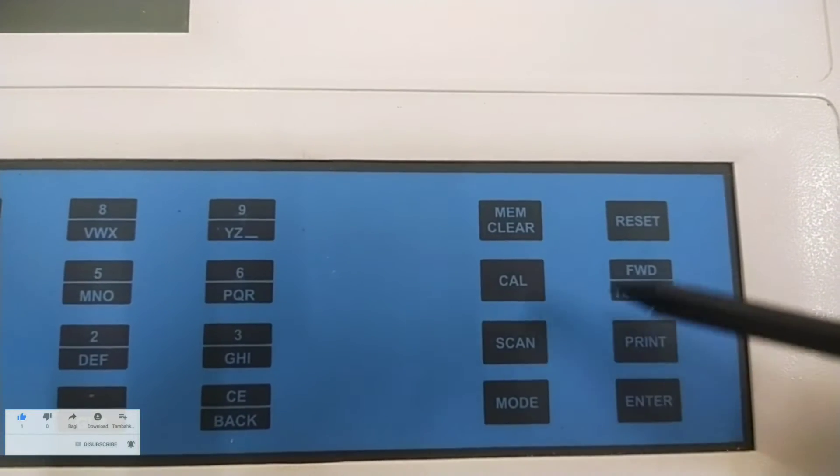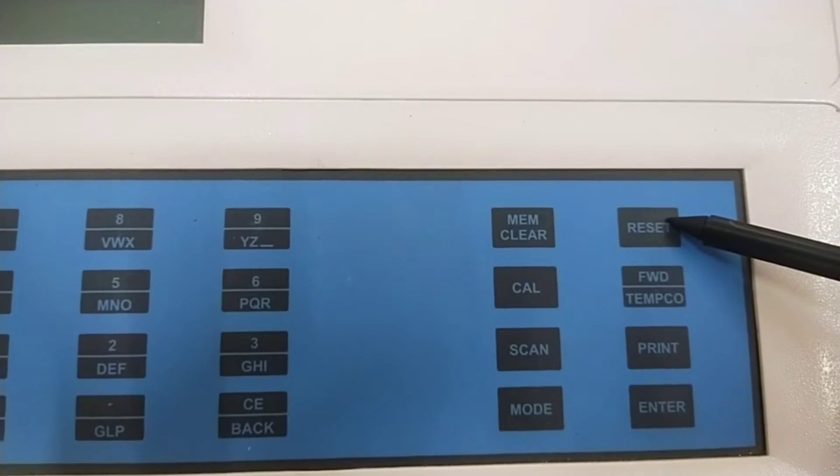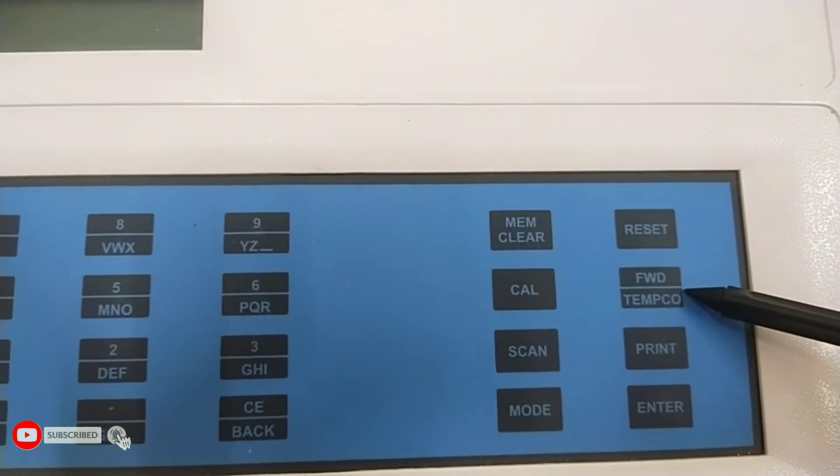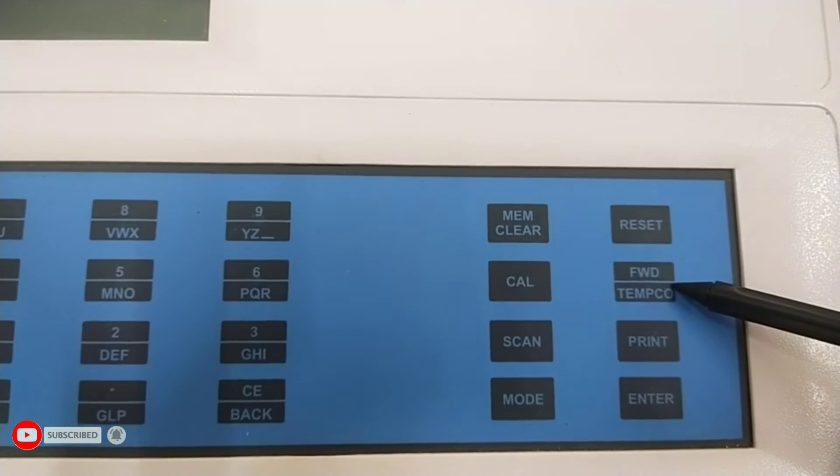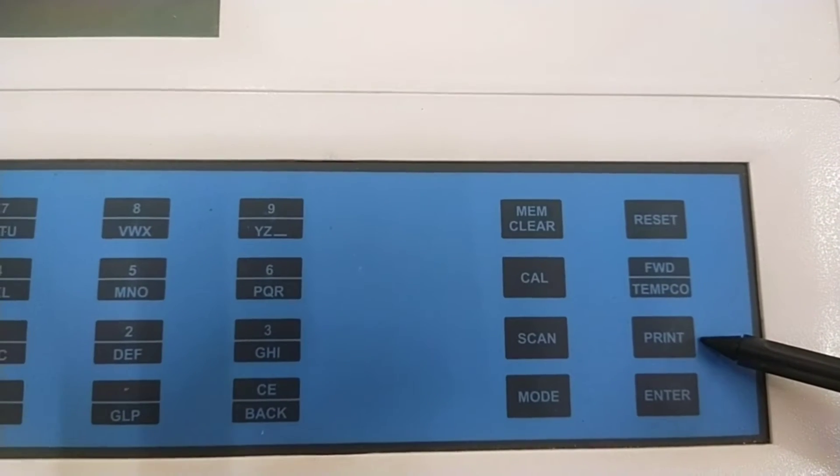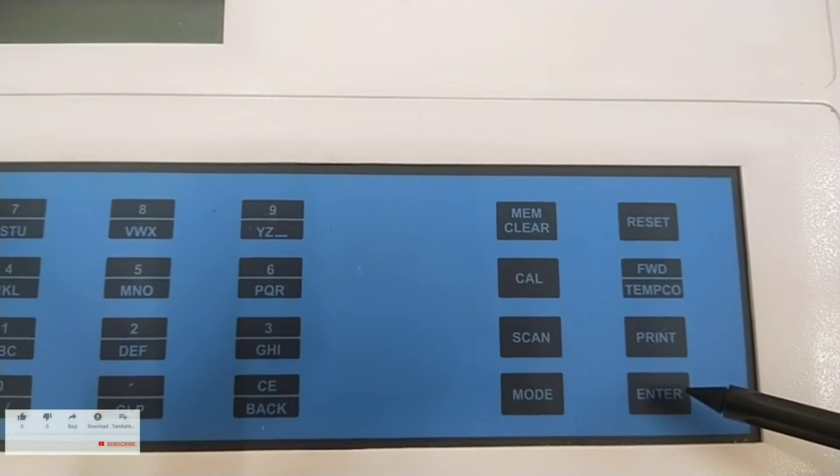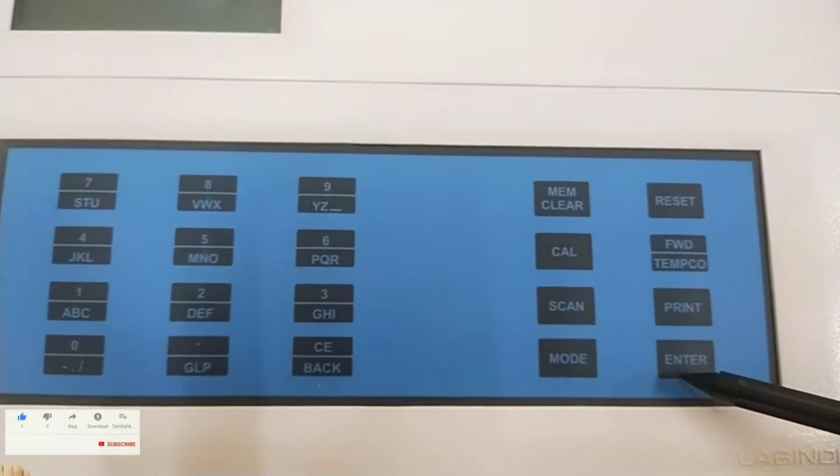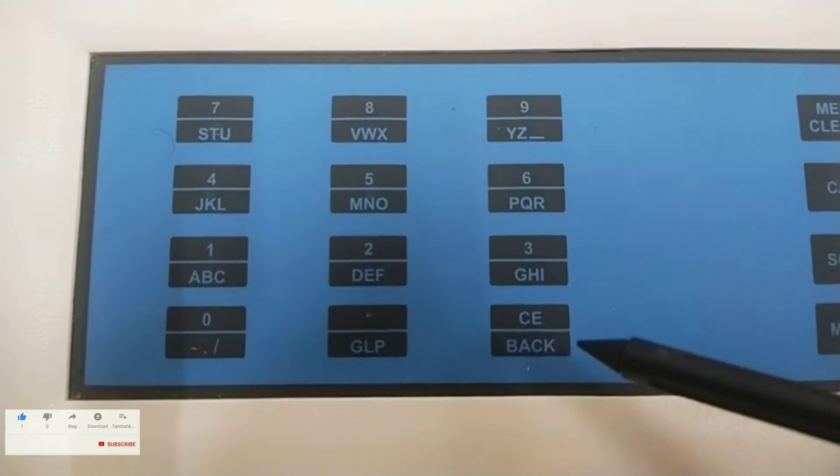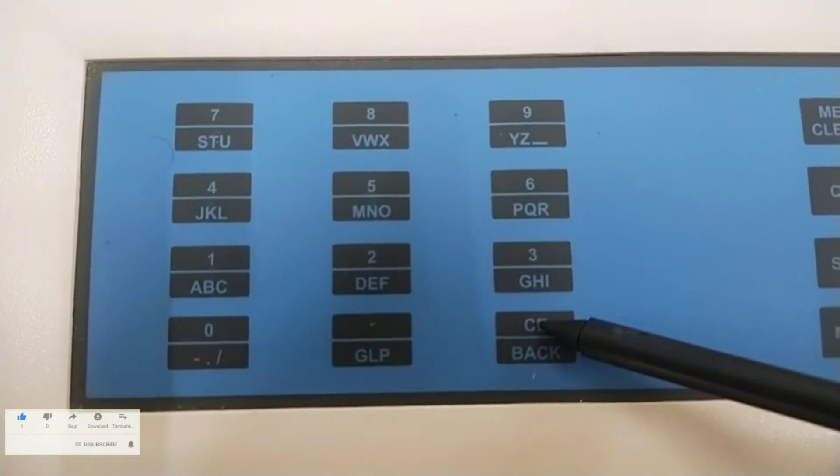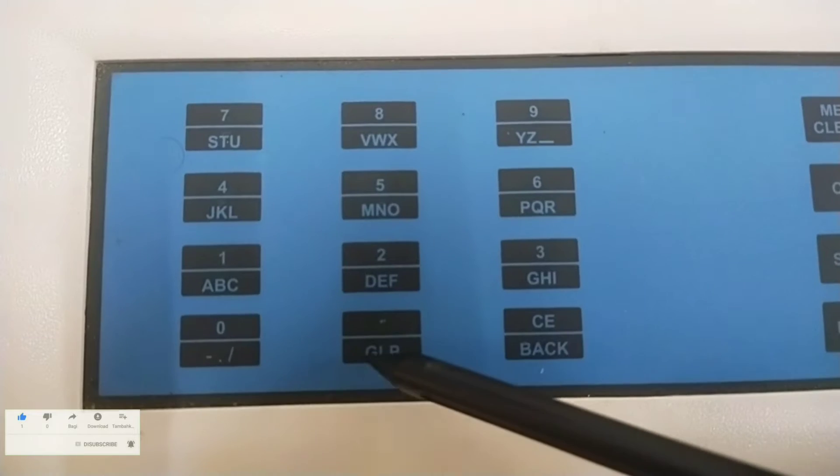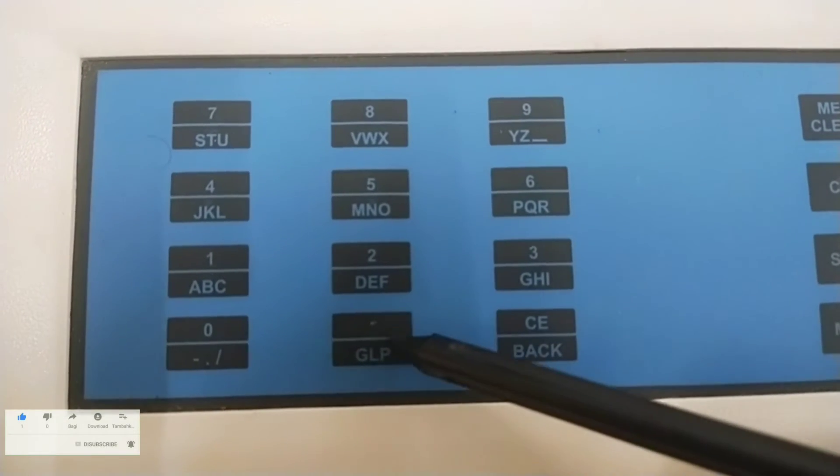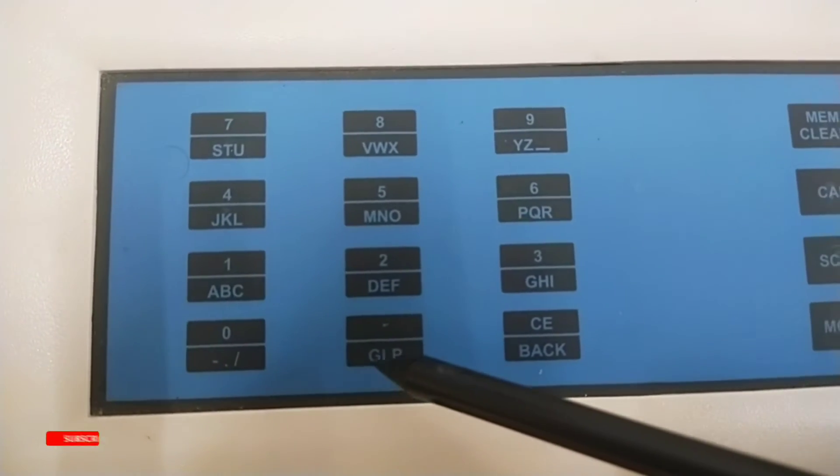Reset key to reset the meter. FWD slash Temco. This key has dual function. Print key to print the stored readings. Enter key to acknowledge the entered value. Clear entry key to clear wrong entry and to go back for previous display screen. GLP key to select the GLP or standard mode between sample measurement and storage.